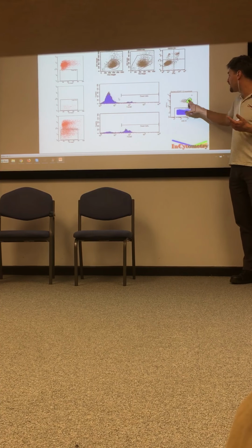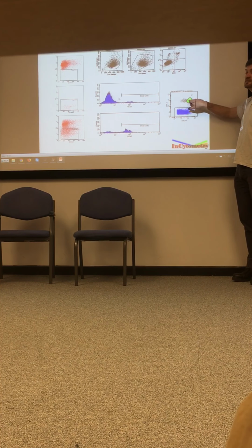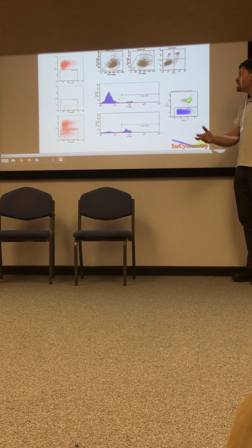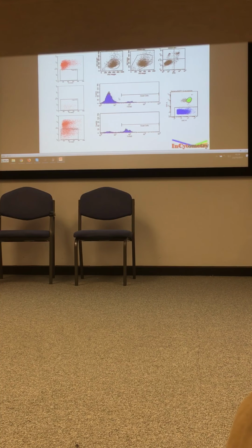So when you've got two very close populations, you need to know what you're looking at when you do your analysis, when you place your gate. But what you would then do, in an ideal world, is run some of this type of biological control, if you had one, or purified cells, or whatever. You'd run those and put a gate on those. Because then if someone says, why did you put it there? You say, because. Here's my supplementary figure 1.